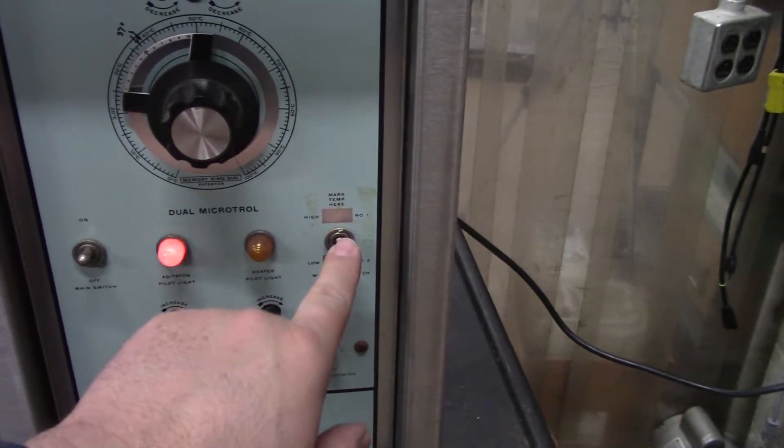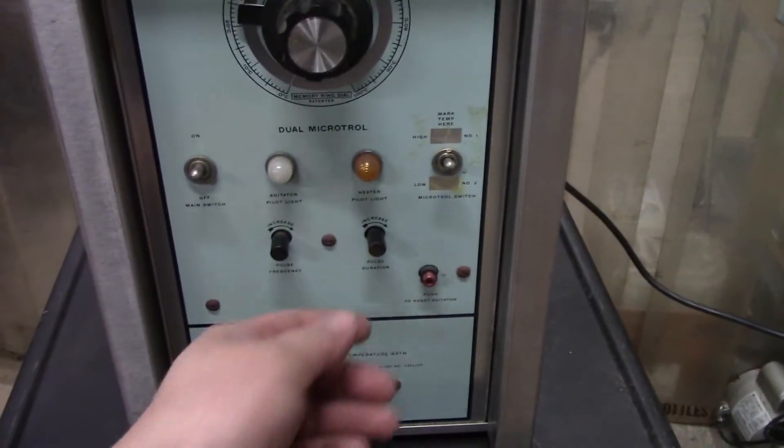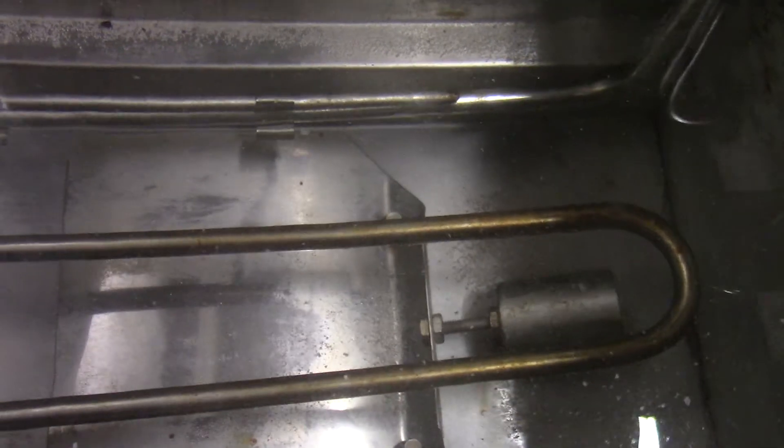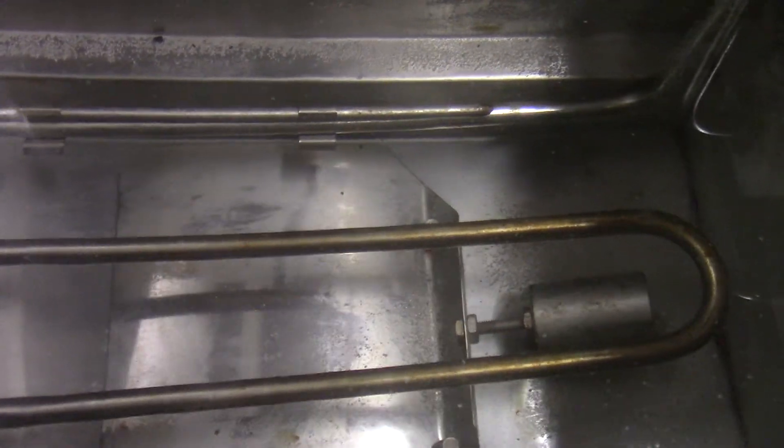This will watch out for your high or low temp and shut the unit off. This has a Magna Whirl pulsing thumper inside. That's how it's moving the water around.